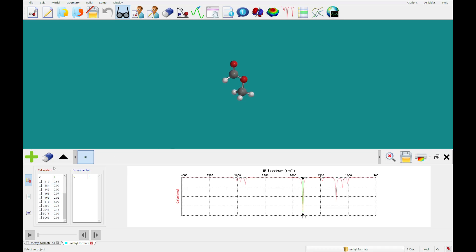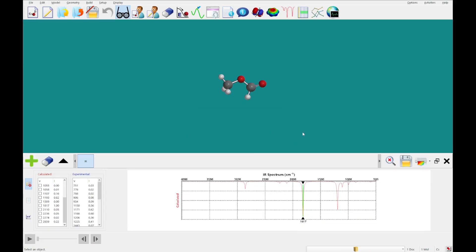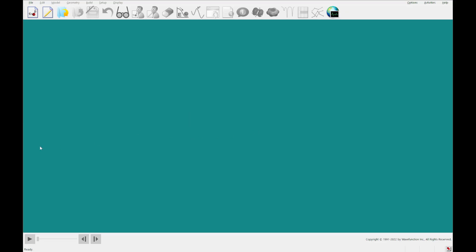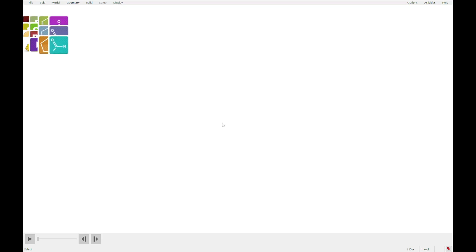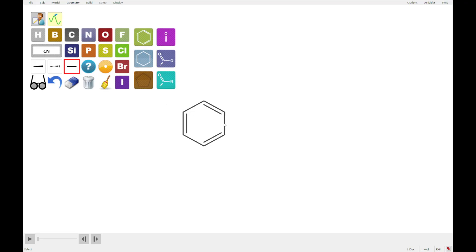So, what I'm going to do now is close out of this, and we're going to move on to an NMR spectrum calculation for 1-methyl indole, and I'm going to build that in 2D, like so. So, click benzene, double click, click cyclopentane, double click on this bond.